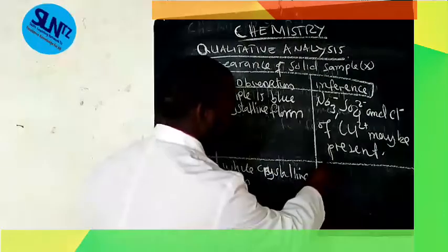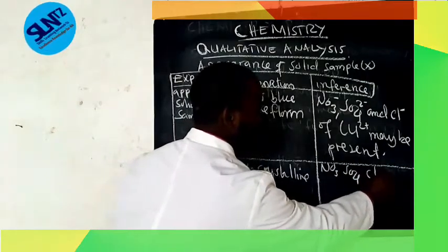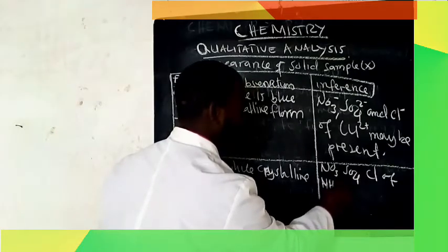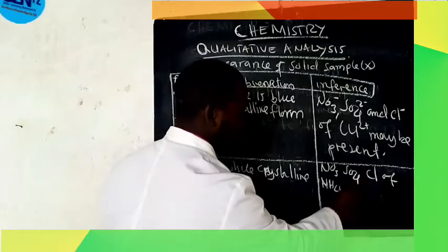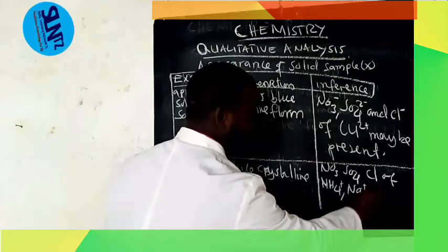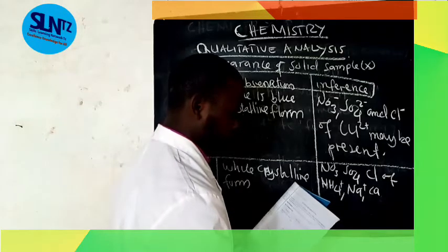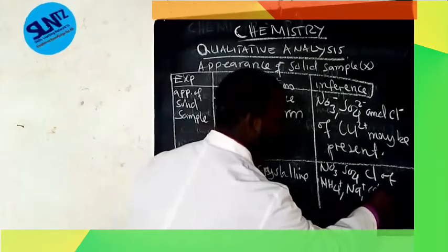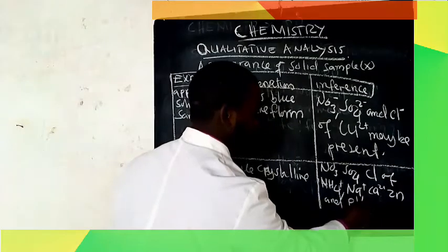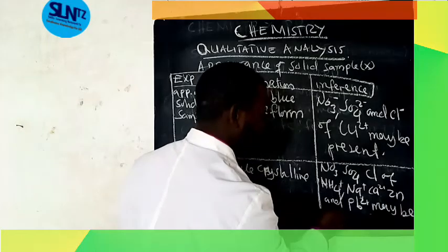But I write the nitrate, sulfate, chloride of ammonium, or sodium ion, of calcium, of zinc, and the lead may be present.